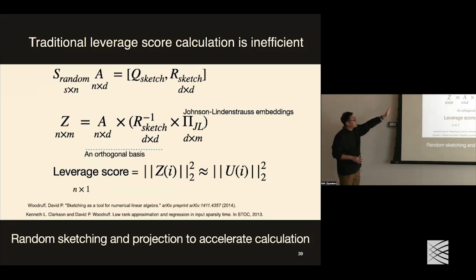And use this S times the cell side of the matrix. The goal here is that they want to learn some gene structure, so based on the Johnson-Lindenstrauss lemma, when we randomize this cell space, those gene relations are still kept. So when they multiply this S with A, this matrix becomes small. The dimension is S times D. S is pretty small, they can just put 5,000, assuming N is 1 million.